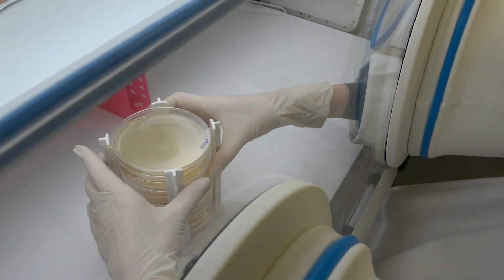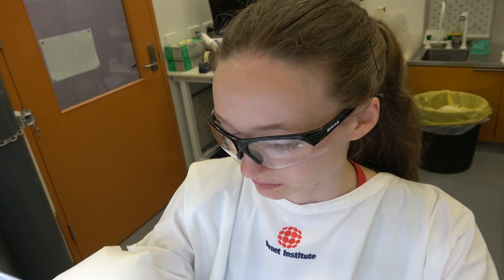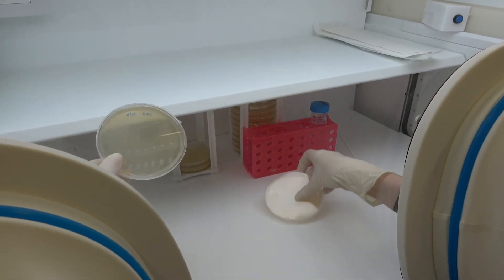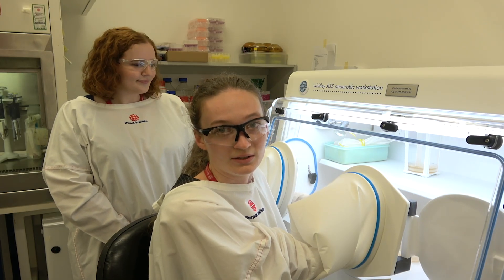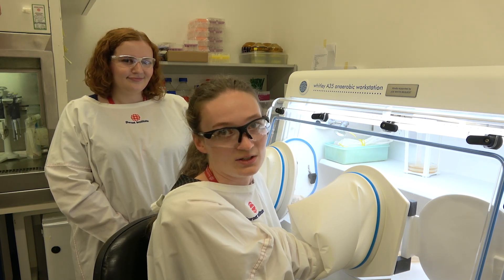In this chamber we can grow bacteria that's isolated from the vaginal microbiome. There are two main projects which we use this chamber for at the Burnett. We're trying to grow different Lactobacillus — a special bacteria found in the vagina. These bacteria are protective, so we're looking to create almost like a probiotic to protect against different conditions of the vagina.